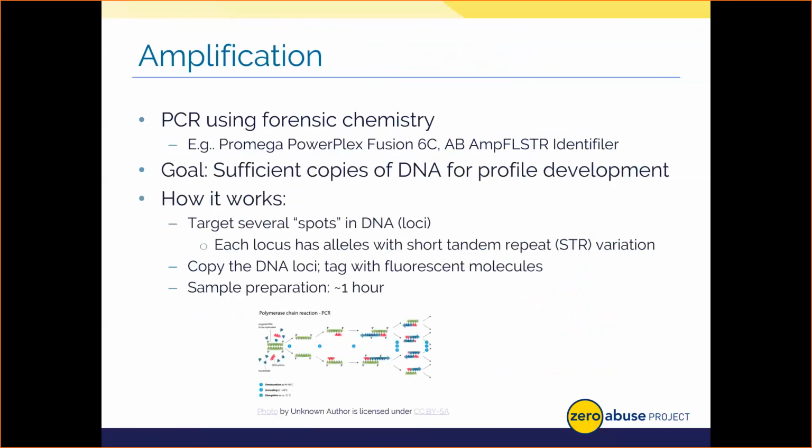Moving on then, once we've got extraction, we've quantified our DNA, we need to go to amplification, where we make copies of DNA such that it can be used to develop that robust profile for statistical analysis and courtroom evaluation as it pertains to tying persons to a given evidentiary item. In other words, with forensic amplification kits, we basically activate a molecular copy machine to make multiple copies of DNA at several loci, all right, or specific spots of DNA.